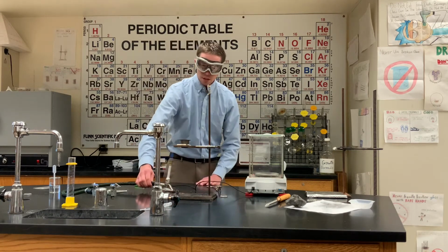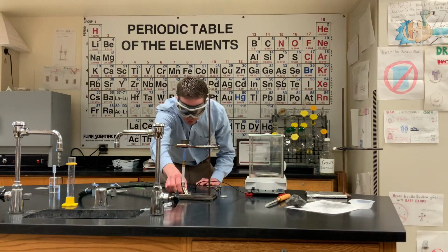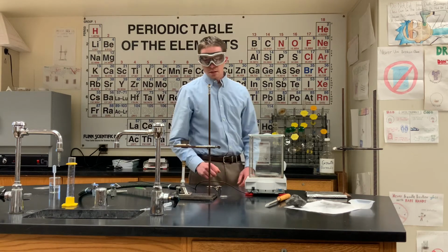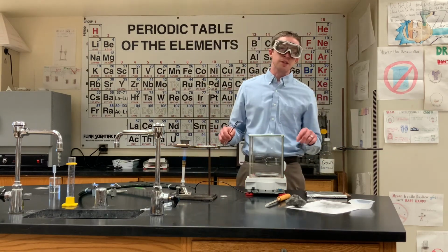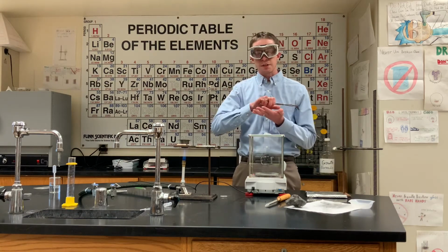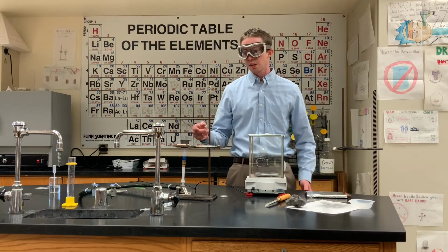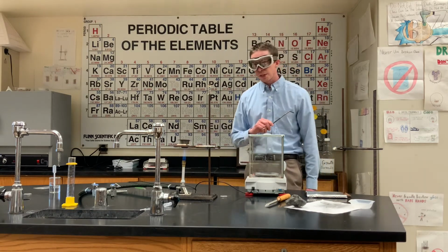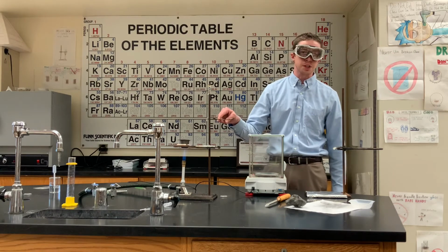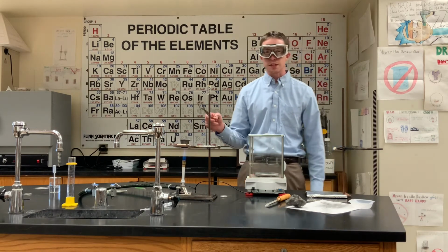Nice roar. Okay, we are going to put it underneath the crucible. And now the reaction will start to happen pretty quickly. The magnesium is going to react with the oxygen. The oxygen is coming from the air. Obviously the crucible is a pretty enclosed space, so in order to make sure that the reaction is getting enough oxygen, we are going to occasionally crack the lid of the crucible. But we are going to make sure that we are not looking inside the crucible at the same time, because this reaction is going to produce ultraviolet light, and it's generally not good for your eyeballs.